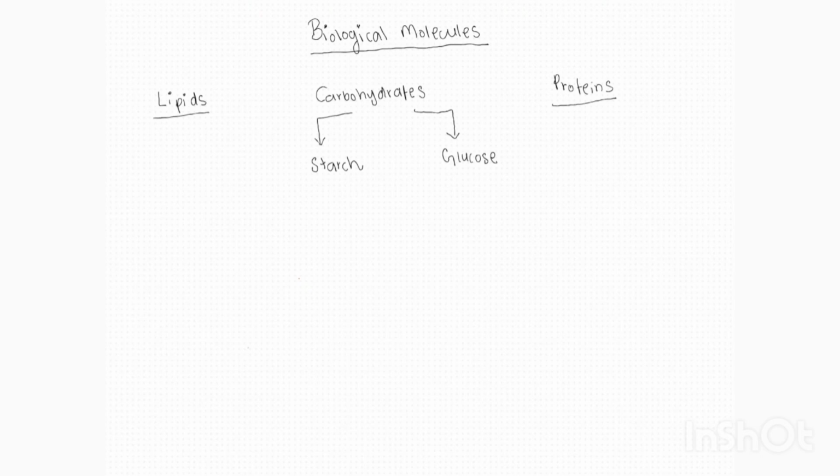Let's start with lipids. Wait, before we start, we are also going to look at why we need to do these food tests. Like why do we need to test for lipids or starch or glucose or proteins, and the practical examples of that in both the medical field and industrial field. So let's start with lipids.